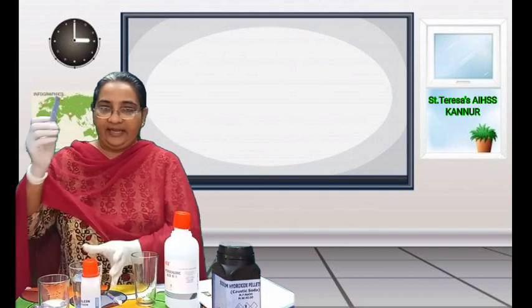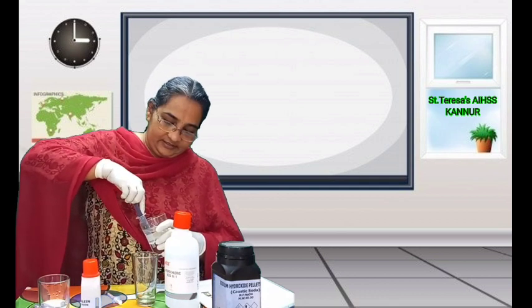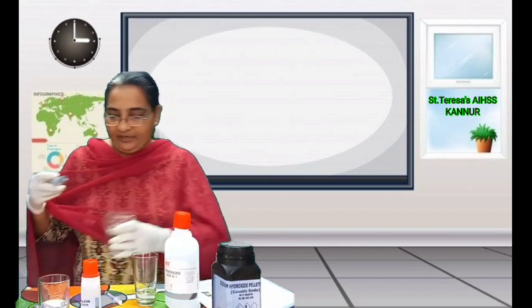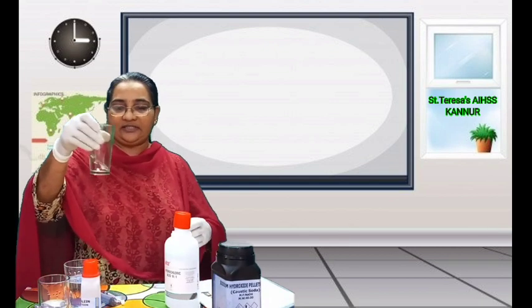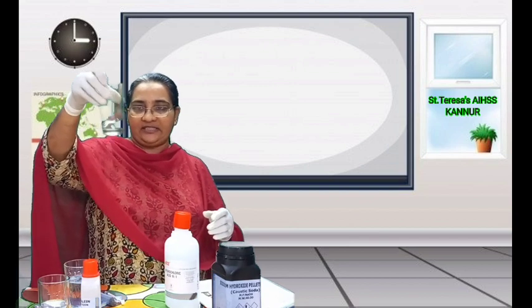water. So here I have a syringe, so we can measure 20 ml here. This is 10 ml that the teacher is putting into the glass. Now this is 10 more. So this is 20 ml of water. Now we have to dissolve this nicely. The caustic soda, that is 1 pellet of caustic soda, has to dissolve nicely in this water.